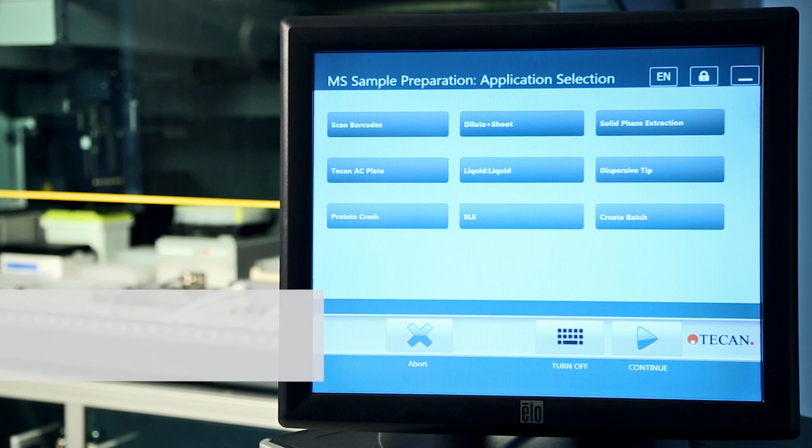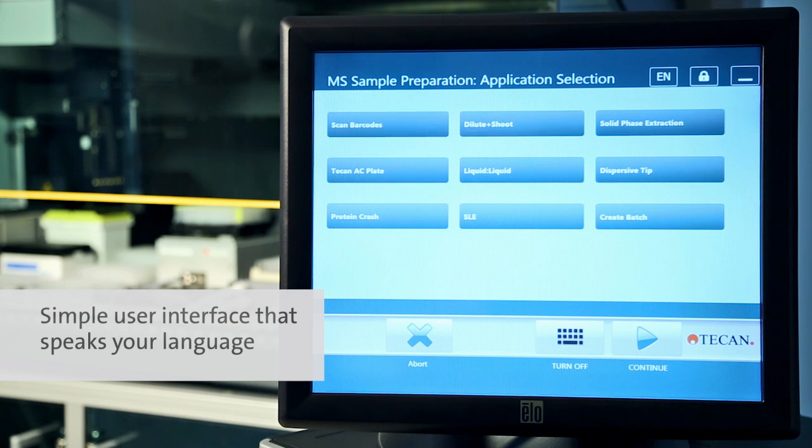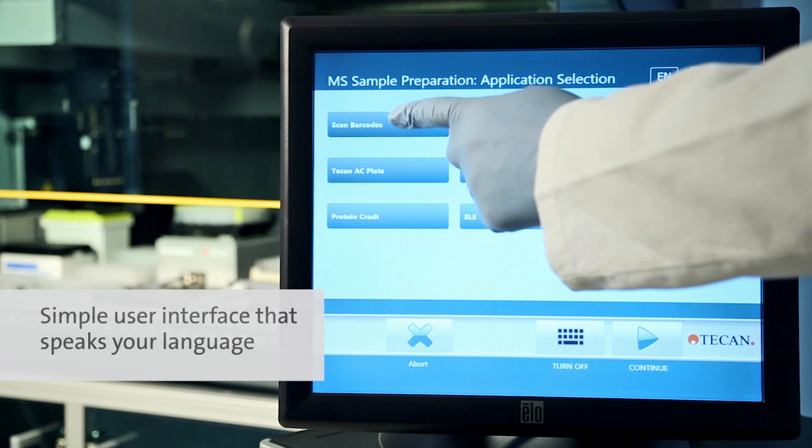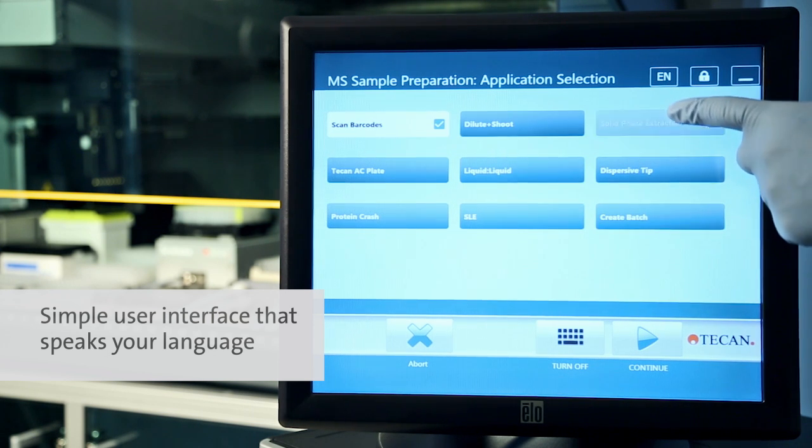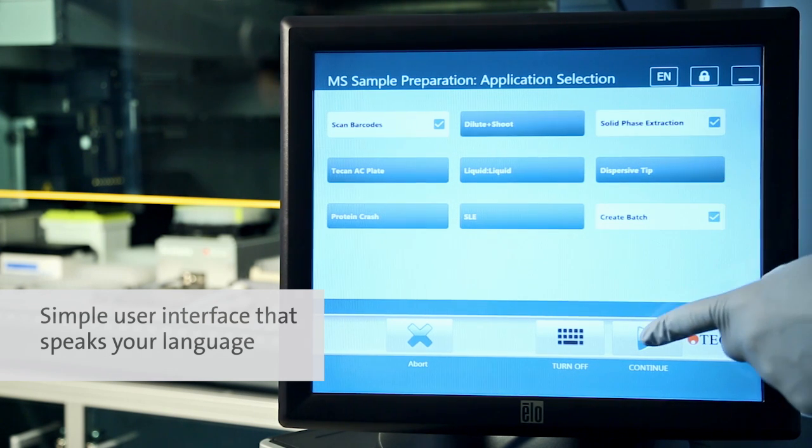The intuitive TouchTool software allows you to select and run your applications with minimal training, making automation of MS assays accessible to everyone in the lab.